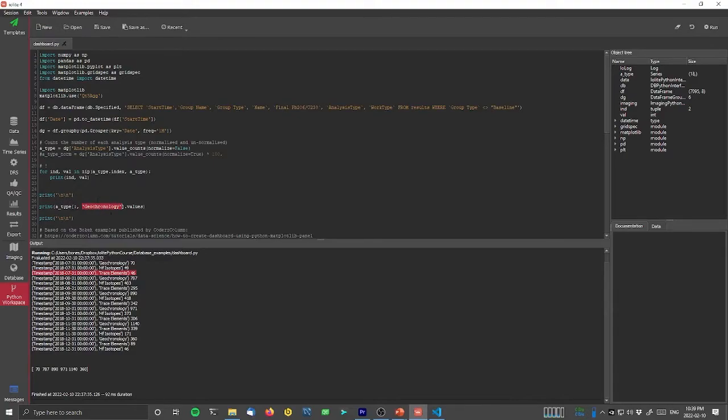So it would print out basically this one and this one and this one here. And that's what this column means. It says all values of this first index, but just the geochronology parts of the second index. And so you can see that's what's actually being printed out here. So it's this 70 value, this 787 value, and the 890 value. They're the values that we'll actually want to plot in our time graph. So these would be the values for each month for geochronology.